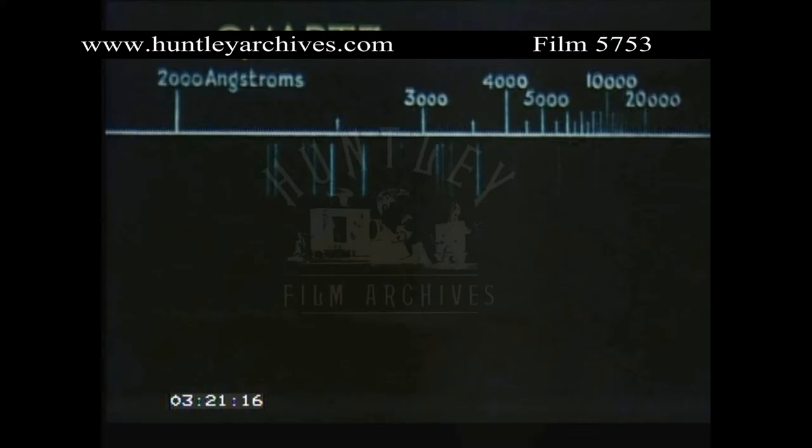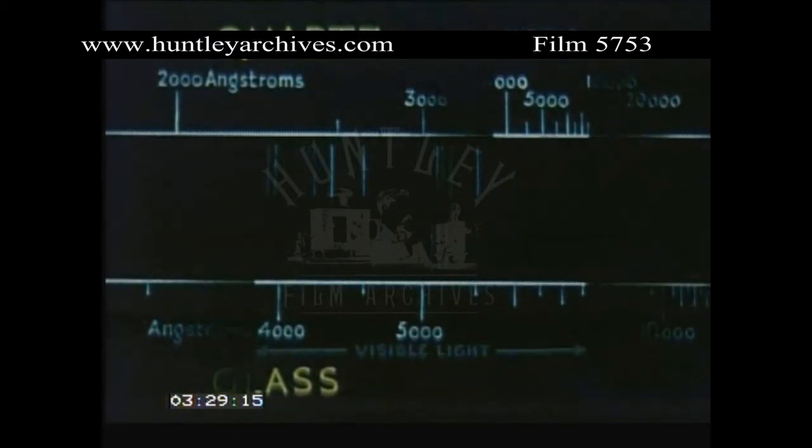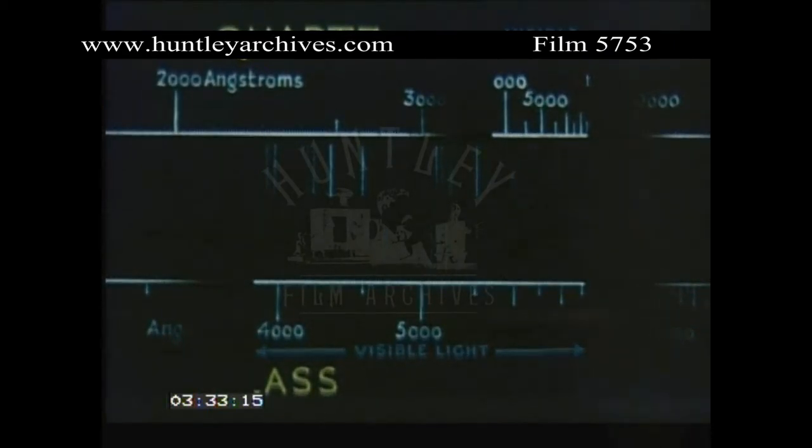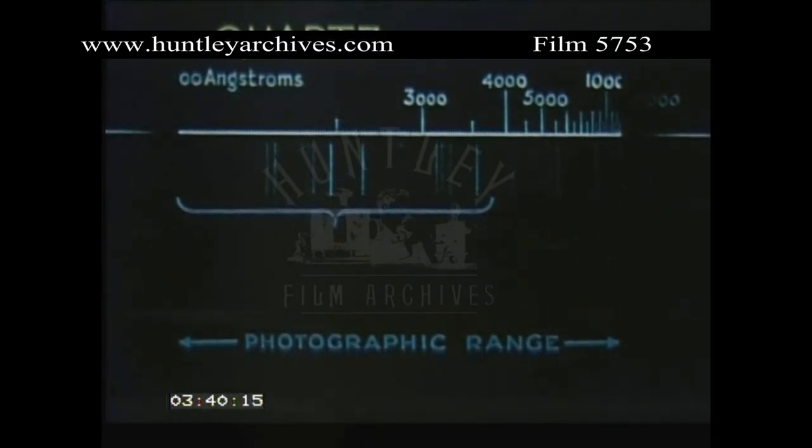Although quartz gives a larger range, it has a lower refractive index than glass, so its lines are not so widely dispersed. But the extra lines invisible to the eye can only be detected and recorded photographically. Spectrograms are therefore essential beyond the visible range.